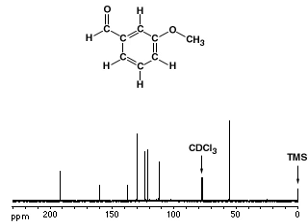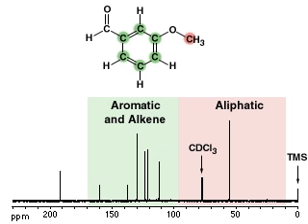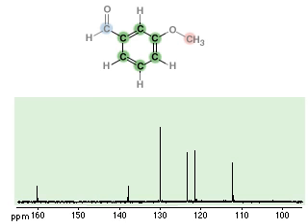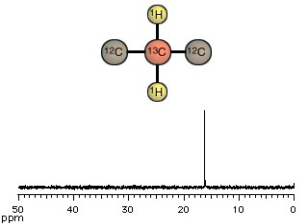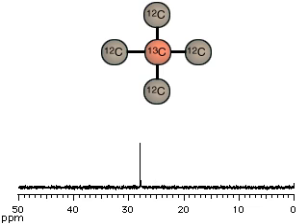In carbon-13 NMR, distinctly different chemical shifts are observed for aliphatic, aromatic and alkene, and carbonyl carbons. Within these regions, precise peak assignment is, however, often difficult. Even unsubstituted aliphatic carbons resonate over a wide range, dependent on whether they are primary, secondary, tertiary, or quaternary.